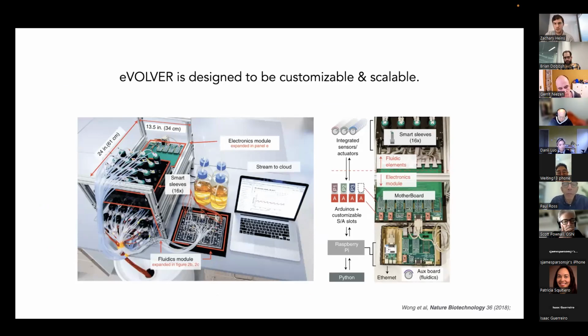For the signal coming in, there's an ADC circuit, which is basically taking the signal from a thermistor or whatever you have on a circuit to translate that voltage into an integer and send that to the Arduino. This Arduino then takes that information per vial and sends it off over serial to the Raspberry Pi, and then the Raspberry Pi has a network connection to your experiment code or any dashboards that you have that are reading that data off.